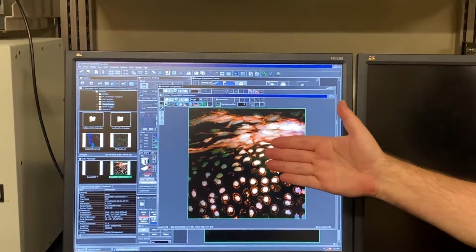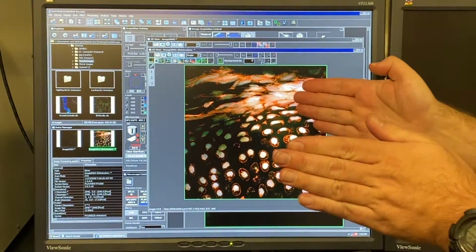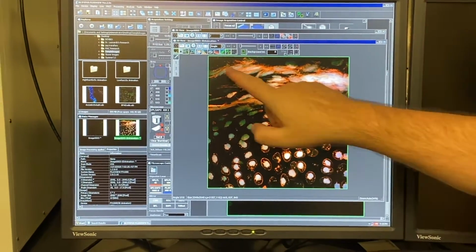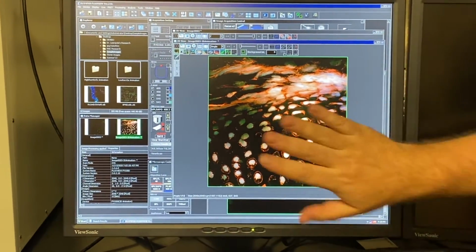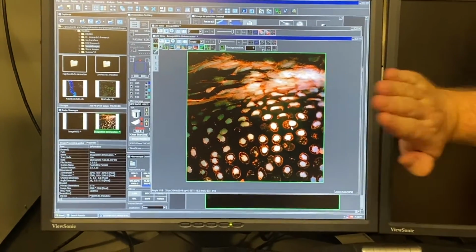So this is like epifluorescence. You are now looking at all 9 pictures at once. They are all stacked on each other. So every bit of red, no matter where it is, you can see it. But what we're going to do is we're going to turn this towards you, okay?